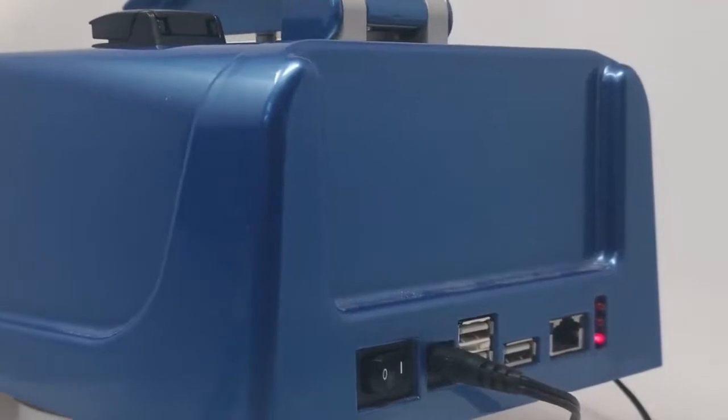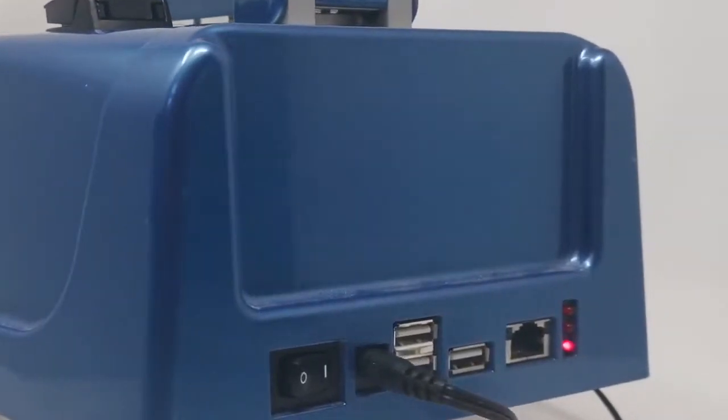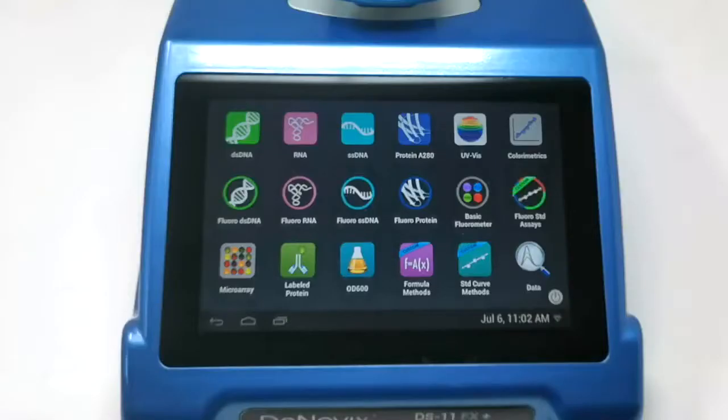And to the rear of the instrument we have 3 USB ports. These can be used for USB memory drives, for barcode scanners, for a label printer, or to attach a keyboard and mouse. We also have an Ethernet connector. So this instrument and these series of instruments can connect to your network either through Ethernet, or we have onboard Wi-Fi as well. So what this allows us to do is to actually give you a range of exporting options that can use the internet, use network drives, as well as we can use things like USB memory sticks.